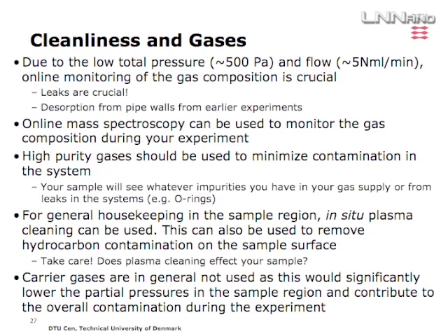So you want to group your experiments. You don't want to do an oxidizing experiment one day and in the afternoon you do a reducing experiment. Forget it. It's more or less impossible. So what you would want to do is you would want to group your experiments. So 1 week you do an oxidizing experiment. The next week you would do a reducing experiment. And then over the weekend you would bake out your system to make sure it's nice and clean.